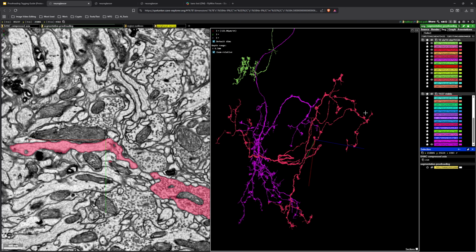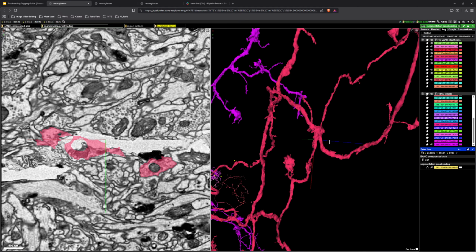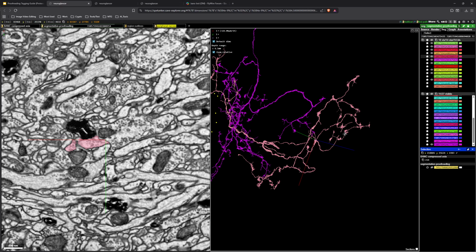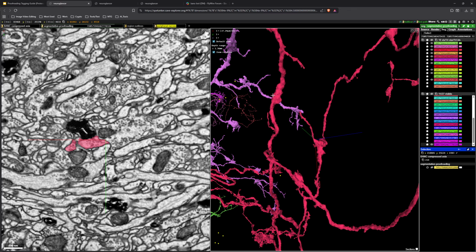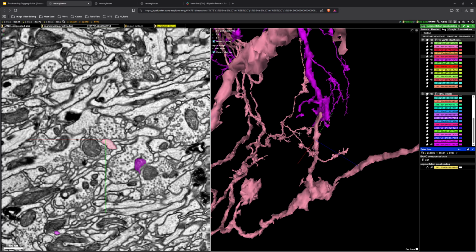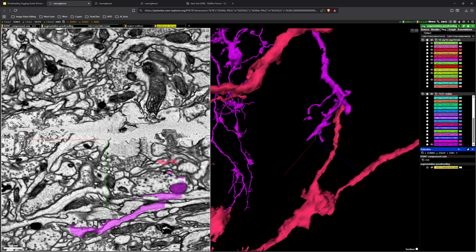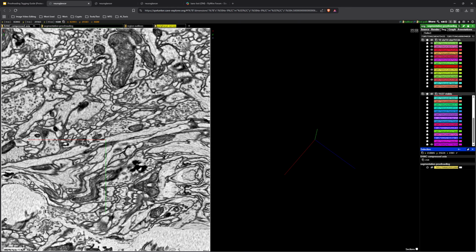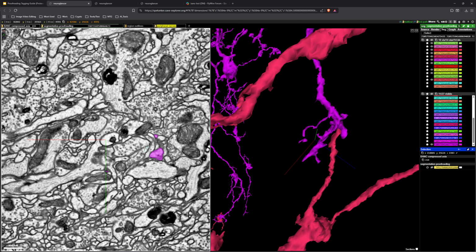As you can see, these branches are not necessarily small, but this might be the quote backbone of this offshoot, and this might just be a branch kind of like this. So this could be small enough that it could be ignored, but if you're a completionist, as I am, I love to trace these difficult areas and really get into where they're going.